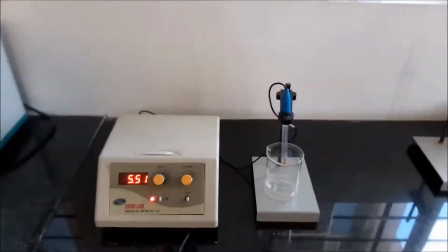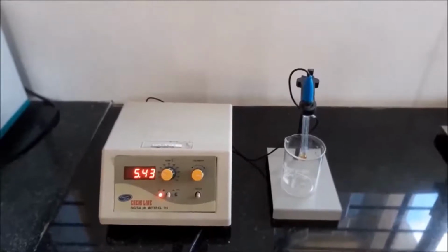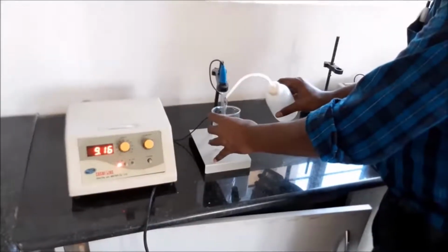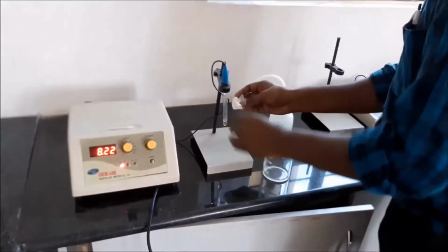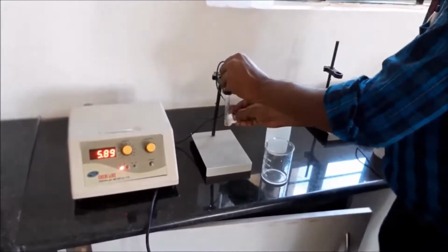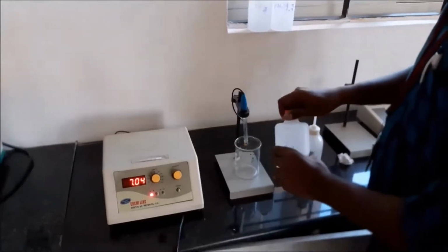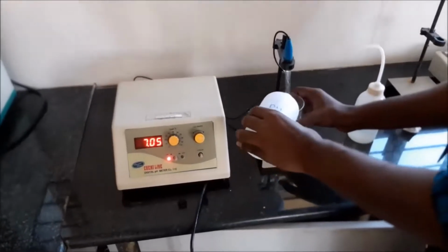For every testing of a sample, the beaker is cleaned thoroughly with distilled water and wiped with tissue paper. The beaker and the apparatus are cleaned with distilled water and wiped with tissue paper thoroughly before the calibration of the instrument is carried out. A sample buffer solution for calibration of the instrument to pH value 4 is taken in the beaker.